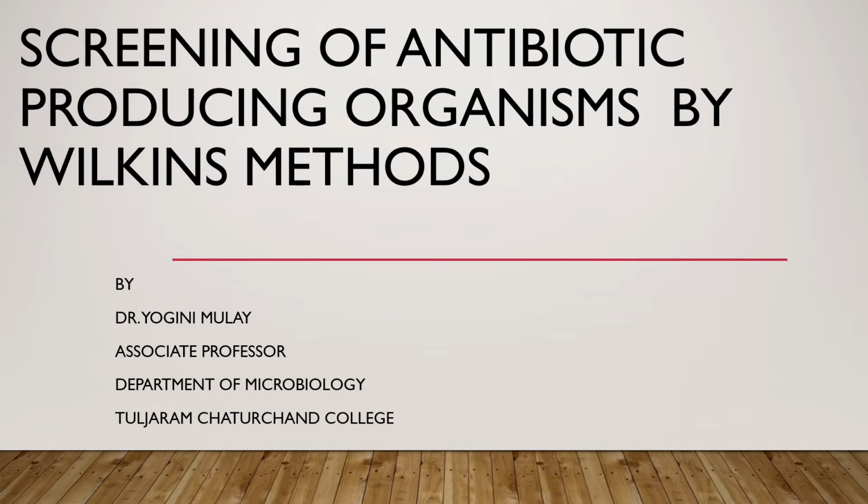If you remember my previous lecture, it was on screening of antibiotic producing organisms by the crowded plate technique. At the end of that lecture, I discussed the disadvantages of the crowded plate technique, where I mentioned it was not possible to distinguish whether the inhibition zone around the colony is because of an antibiotic produced by the organism or because of acid produced by the organism. That problem is overcome by Wilkins method.